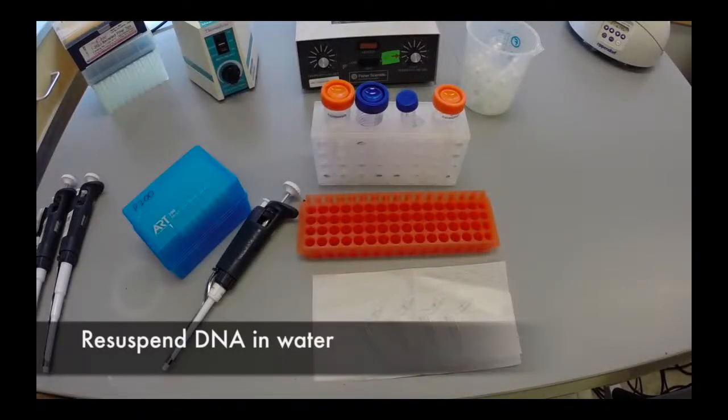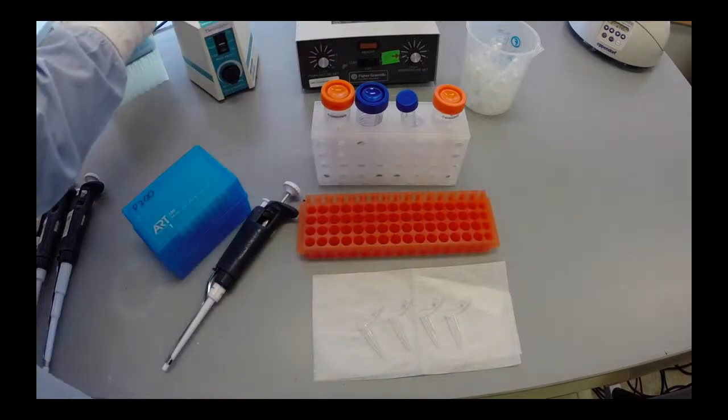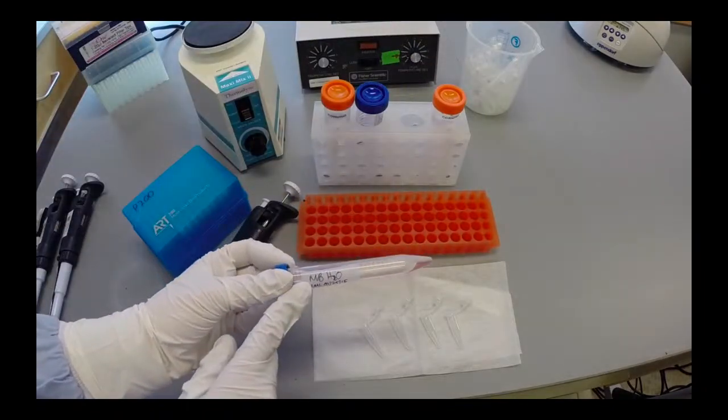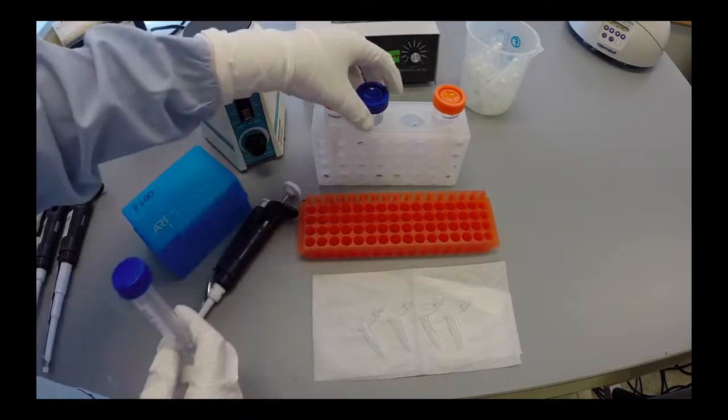If the tube still has spots of solution or if the pellet does not look dry, allow for evaporation to continue. If the pellet looks dry, then resuspend the DNA using water. Add 100 microliters of molecular biology grade water directly onto the pellet side.